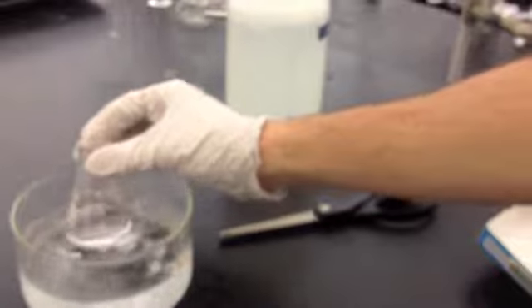You want to wet your filter paper with some either deionized water or whatever solvent it is that you're actually using. So in this case, I'm going to wet it with some cold ethanol, just a little bit.